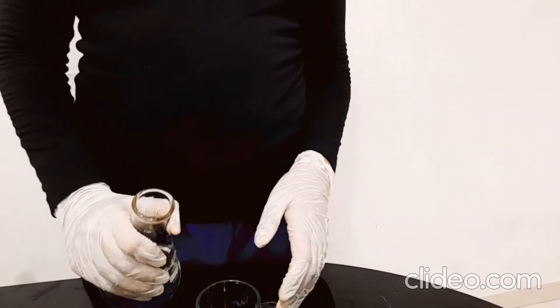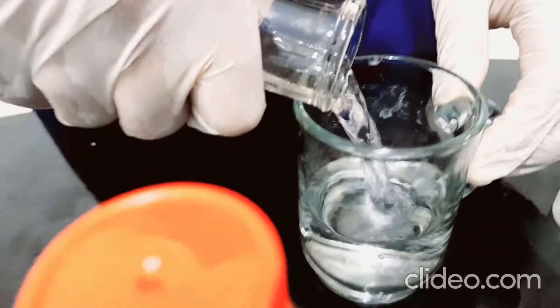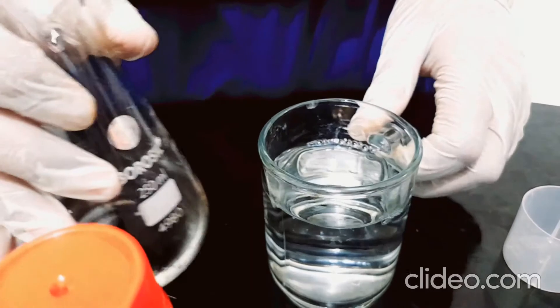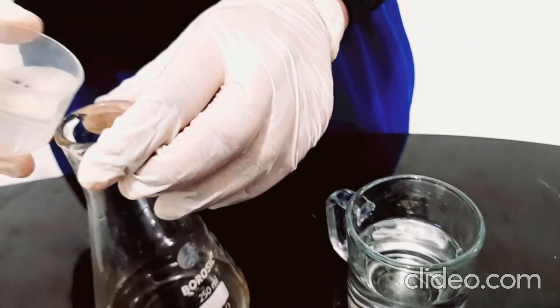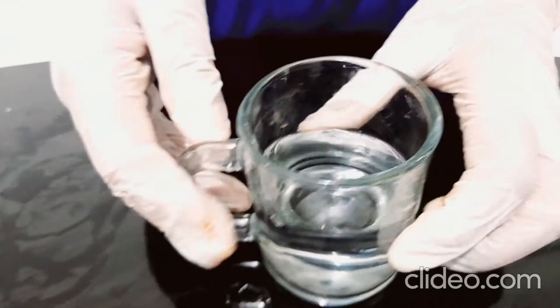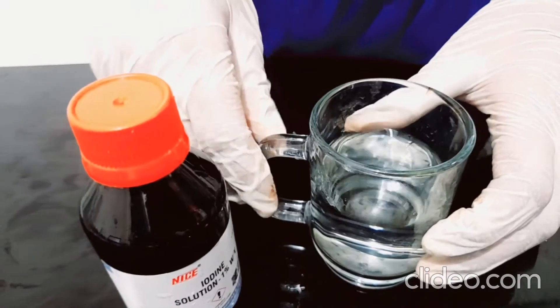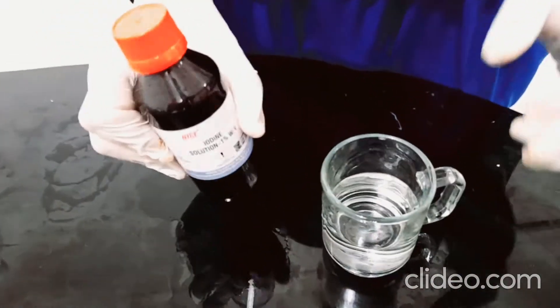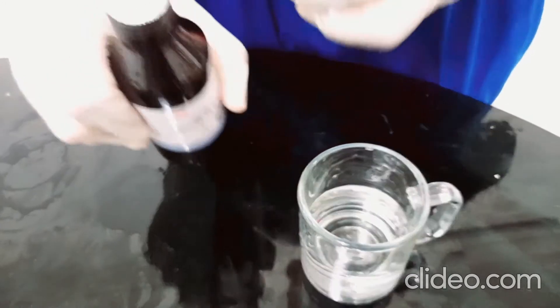Here begins the second experiment. I'm going to add a bit of water to the glass — I think that should be a bit more, so I'll pour a bit back. Exactly, that is the amount we need. Let's keep this flask aside. First of all, to dilute the iodine I have this glass of water here.